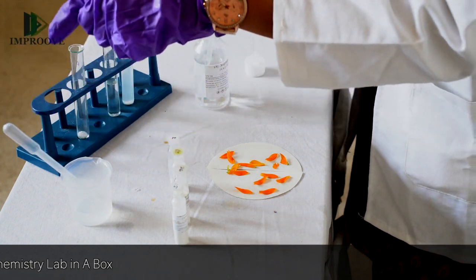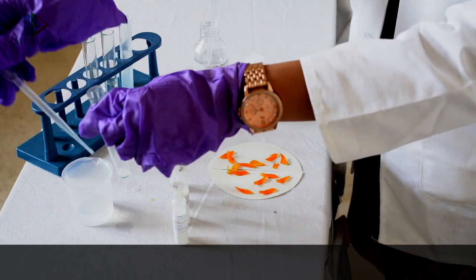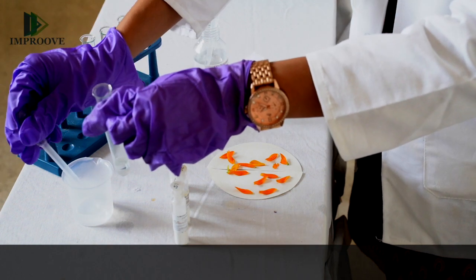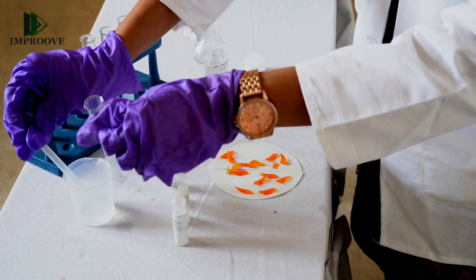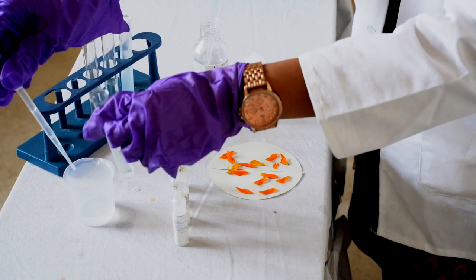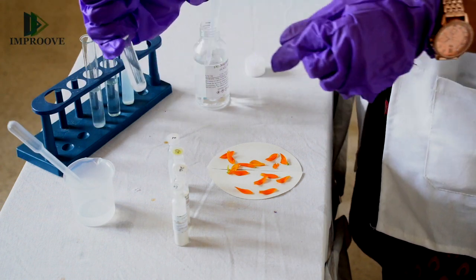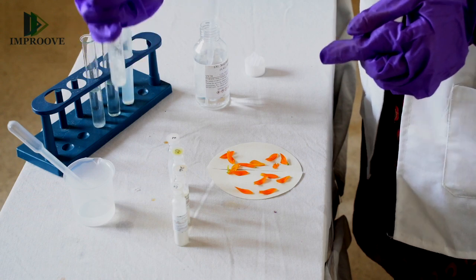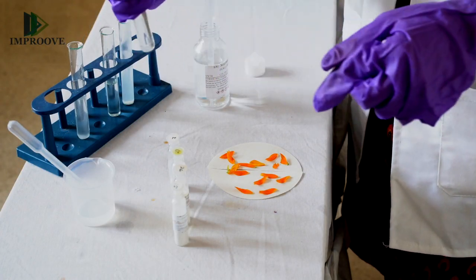Add 10 ml of water to the final test tube as well. Once that is done, you need to shake the contents well of each of the test tubes. You can place your thumb over or you can also use a cork to do this. Allow them to settle down and allow the mixtures to completely mix well.